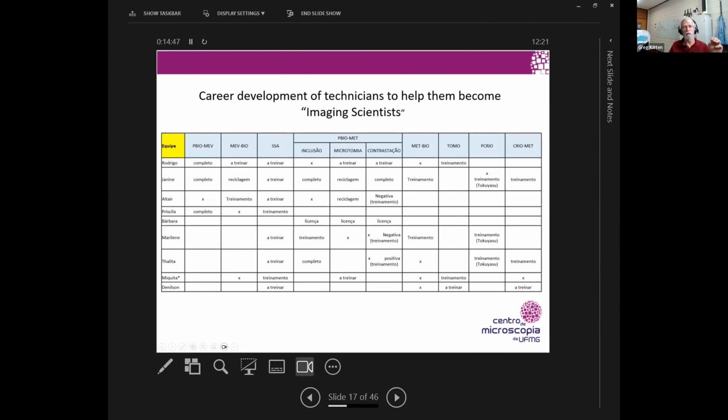We also do something, I just wanted to show this because when you talk about companies, you always have to be sure that you don't stop when somebody goes on vacation and these things. So we have level 1, level 2, and level 3. Level 1 is the people that know the microscope system in and out. They've worked on it for years. They're the leaders on that microscope.